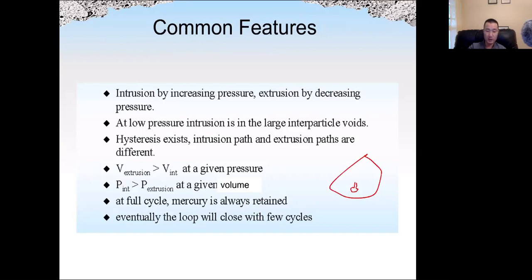The intrusion is caused by increased pressure, and extrusion is caused by decreasing pressure. In theory, if the pores are perfectly spherical, intrusion and extrusion should be the same.